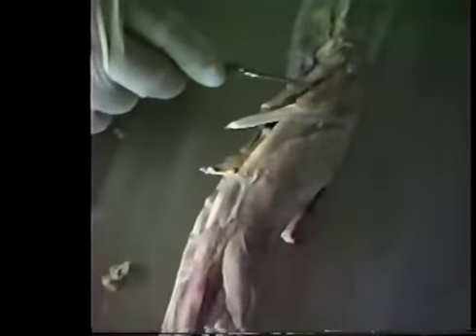This muscle that has the fascia attached to it. This is actually the muscle part of it up here. This is the tensor fasciae latae muscle. On the other side, here's the tensor fasciae latae muscle.